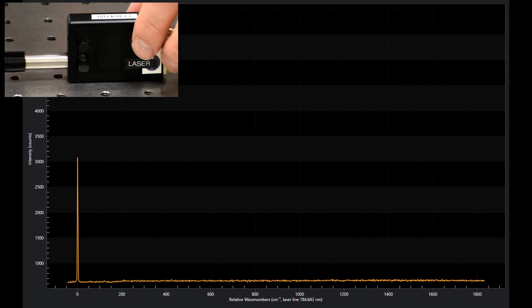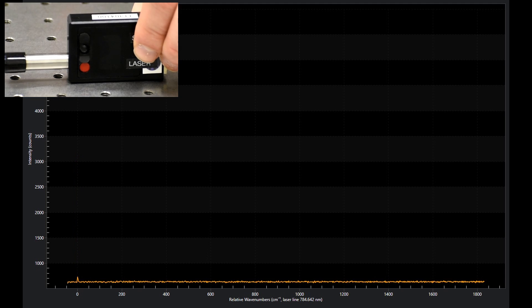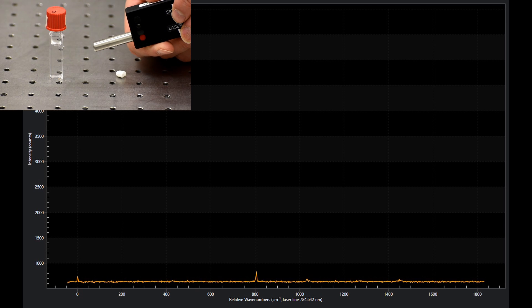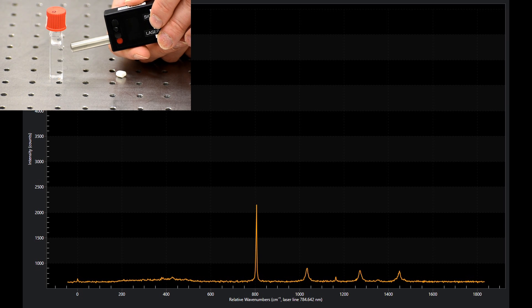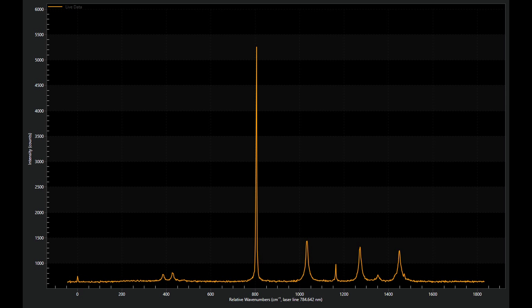Open the probe shutter to direct laser light out of the probe. Here we use cyclohexane and Tylenol samples. Place the probe in 5 to 10 millimeter distance of the sample for optimal signal strength and collect the Raman spectra.